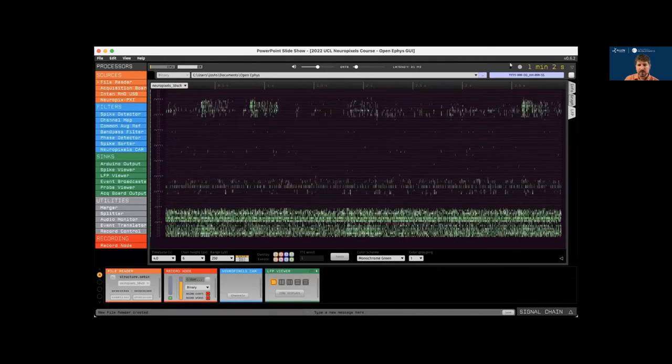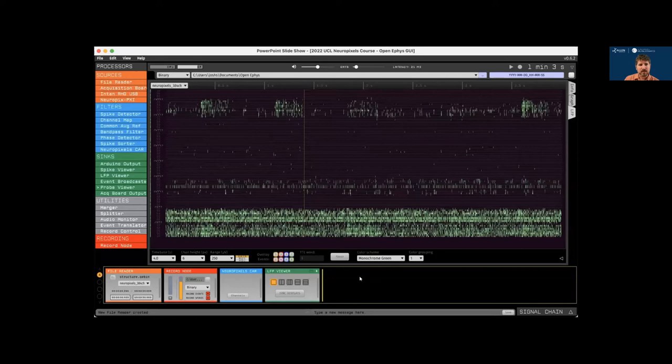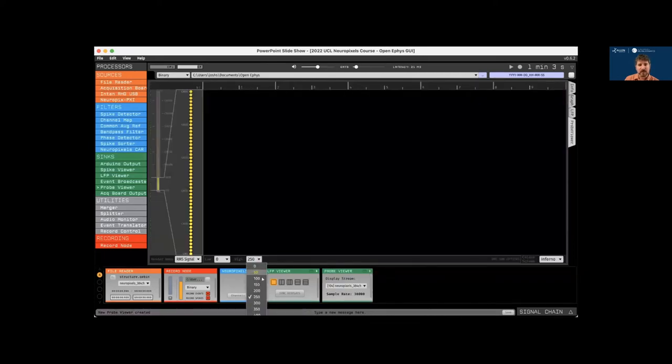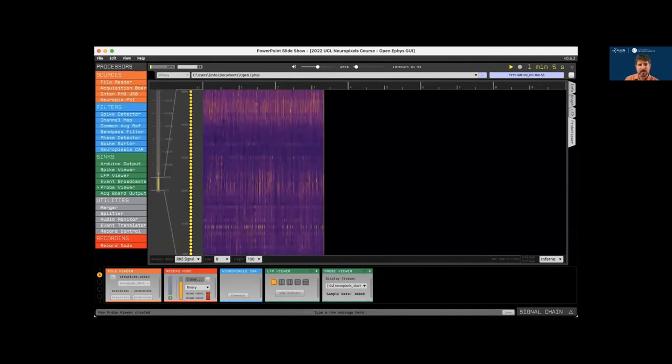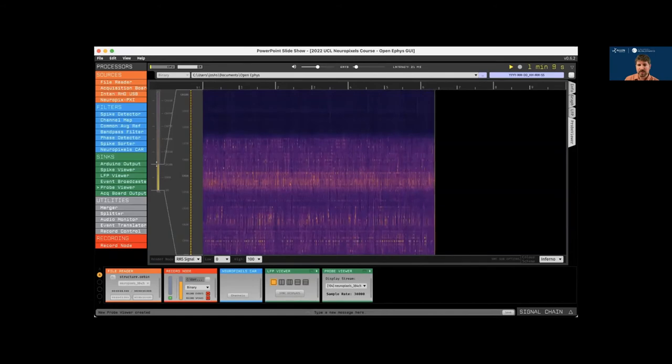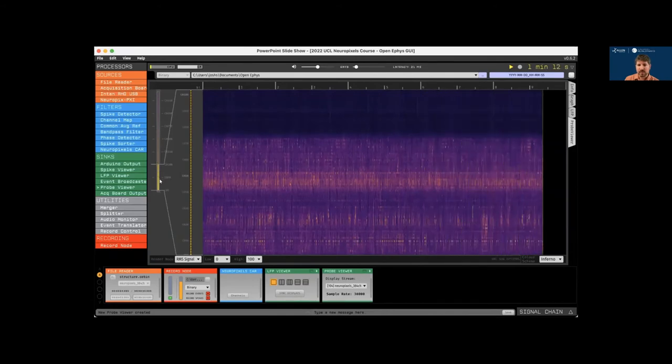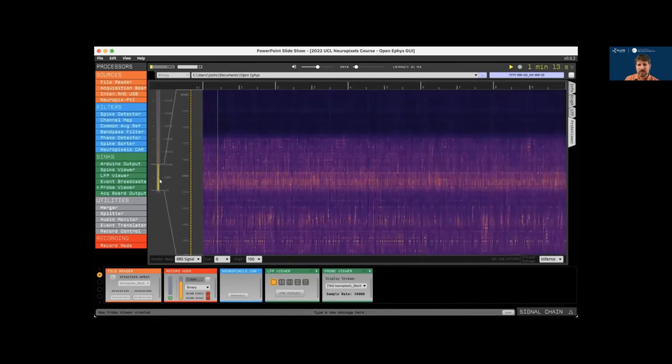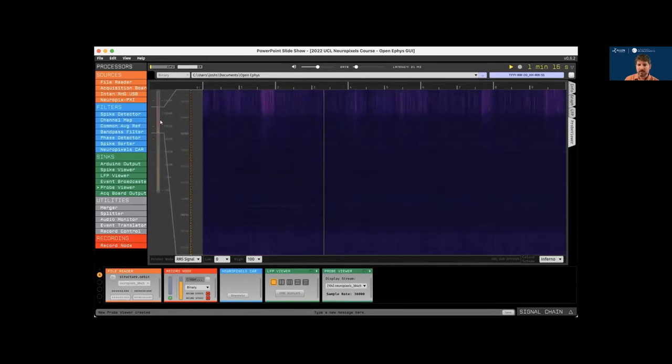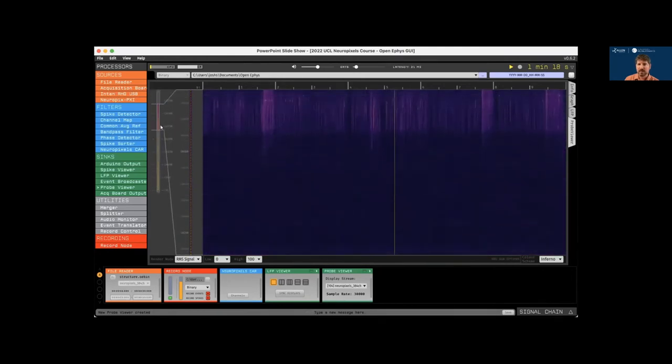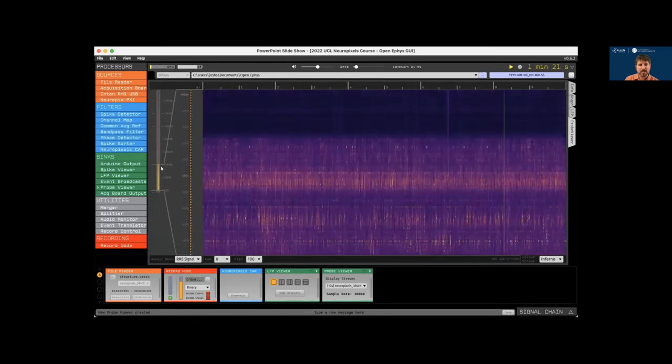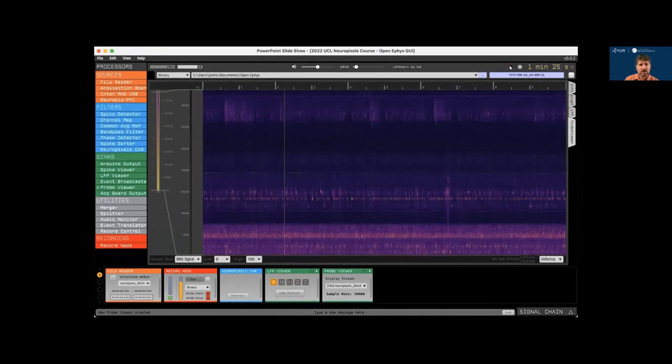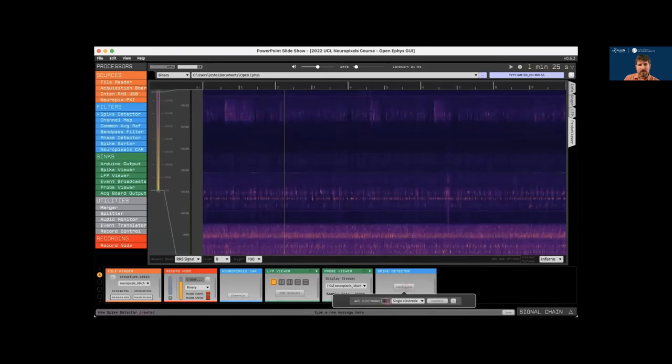And another visualization that works well with Neuropixels is the probe viewer. So we can drop this to the right of the LFP viewer. And this will allow us to view our voltage traces as a heat map over time. We can expand the channel range a little bit and scroll up across the length of the probe. So this particular recording has channels in cortex up here, hippocampus in the middle, and thalamus at the bottom. We can also expand the display to visualize the whole probe at once.